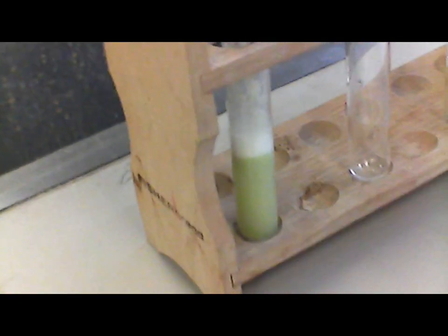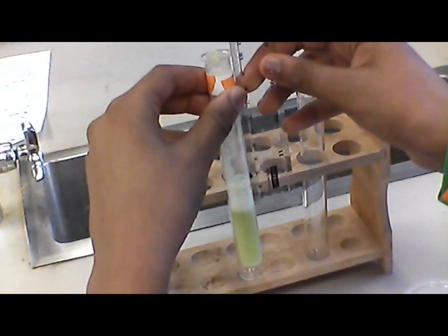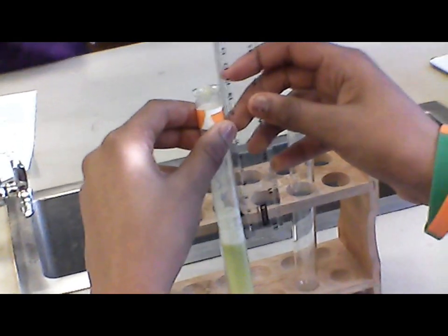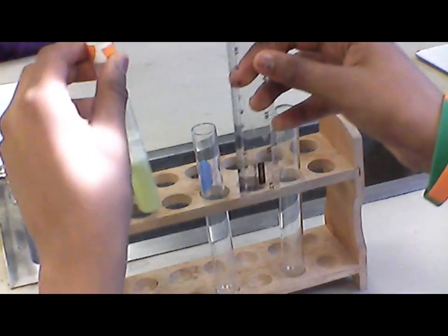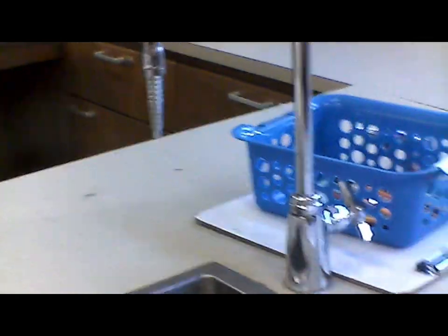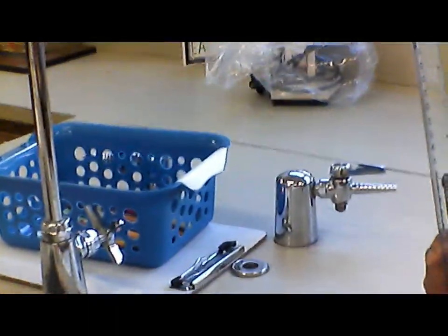The mixing, guys: you're going to drop the avocado in the mixing cup, and you're going to use a different dropper to add the vinegar. You're going to mix the vinegar in the avocado. You put that into the test tube. Then you add the hydrogen peroxide. So you're mixing up vinegar and avocado in the mixing cup, then putting that in the test tube and then adding the hydrogen peroxide.